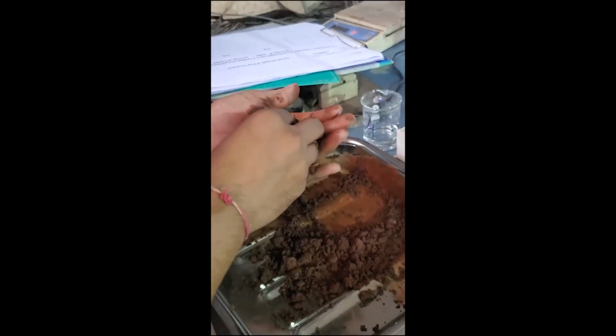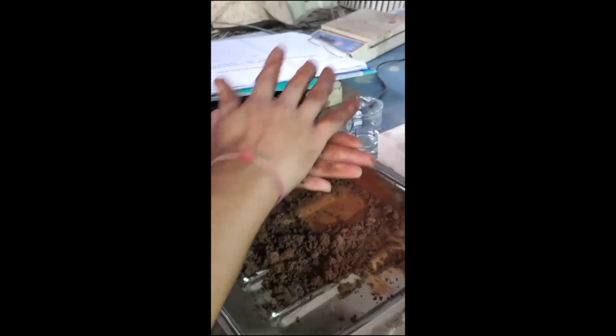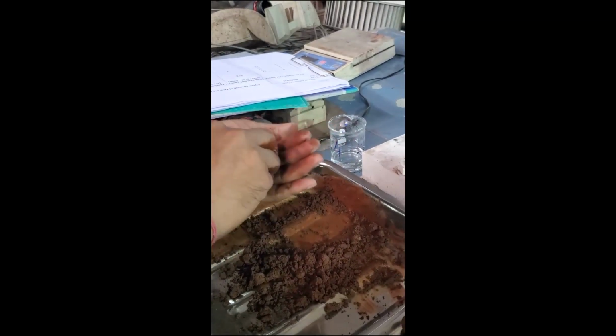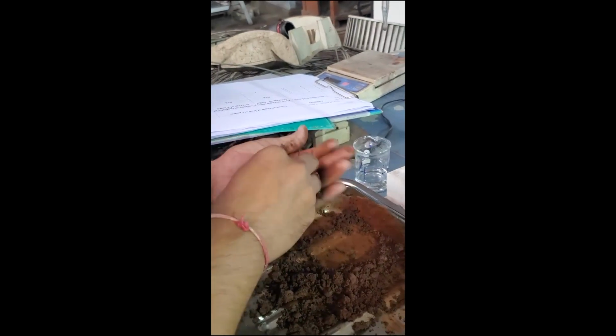Like that we will make a number of pellets because we have to take the average reading of crushing. In case of crushing strength also, in case of drop strength also, we can't determine the strength for a single pellet. That's why we want to make at least 4 pellets. So this is the procedure of making the pellet.